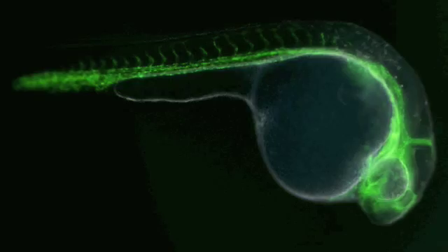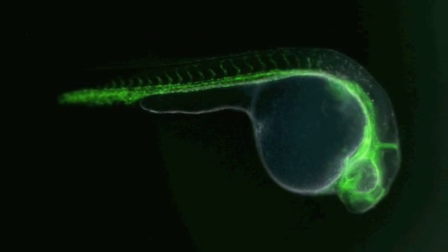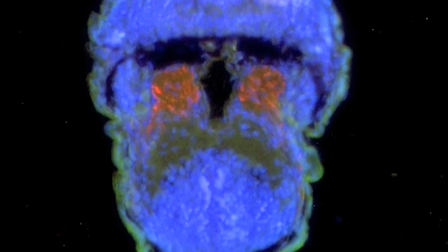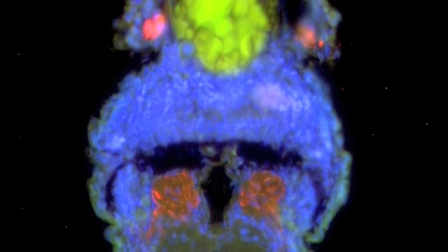Shown here is a digital micrograph obtained by a former student in a pilot proof of principle experiment. For subsequent analysis at the cellular level, the transgenic fish may also be sectioned and placed on microscope slides to get a closer look.